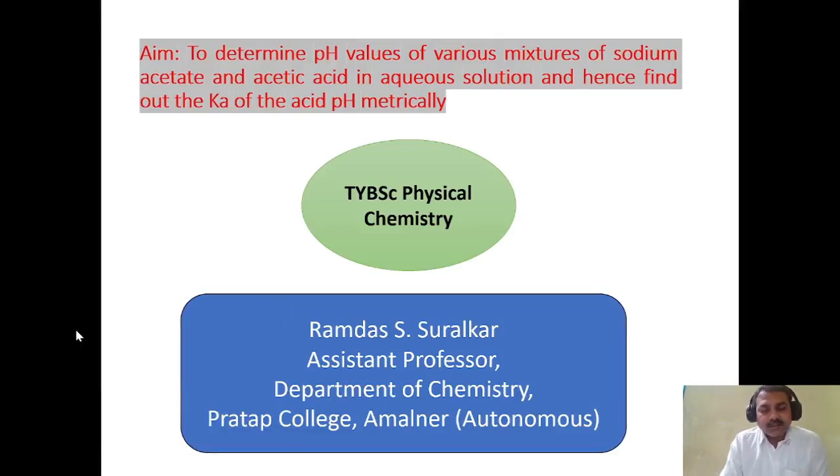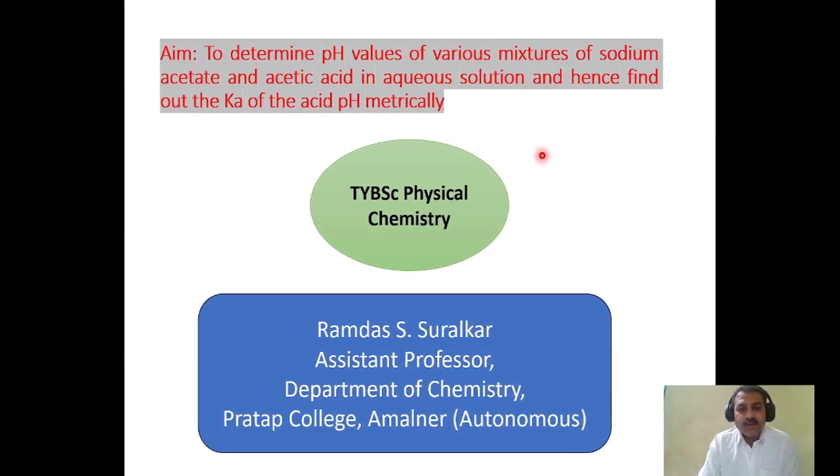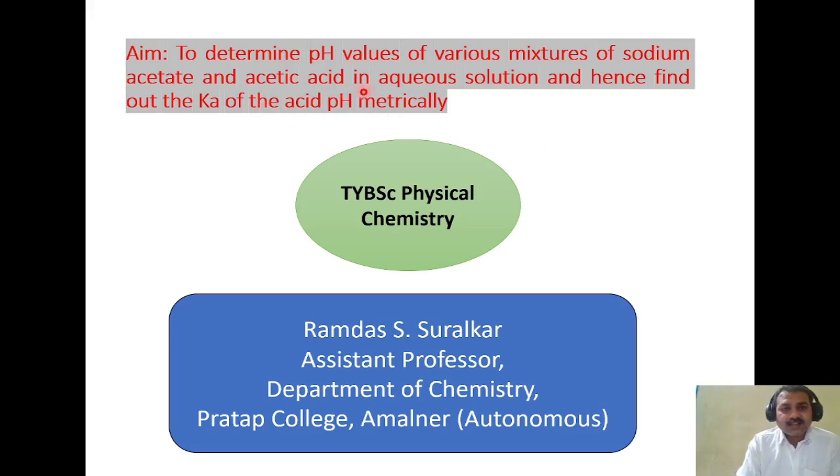Hi friends, today we are going to perform the practical of TYBSc physical chemistry. The aim of the practical is to determine the pH values of various mixtures of sodium acetate and acetic acid in aqueous solution and hence find out the Ka of the acid pH metrically.